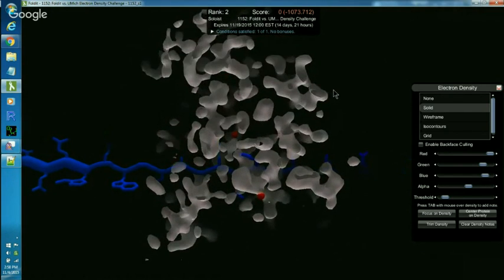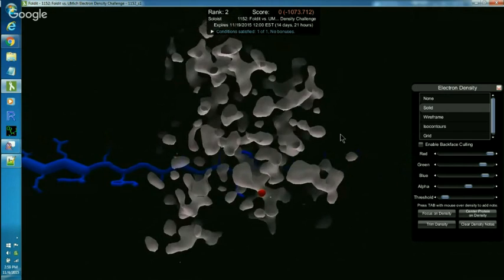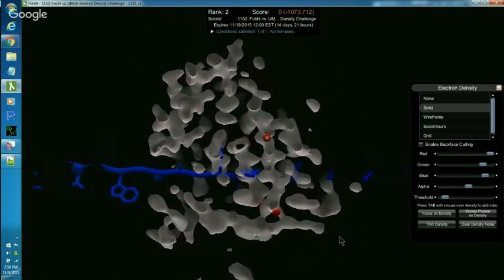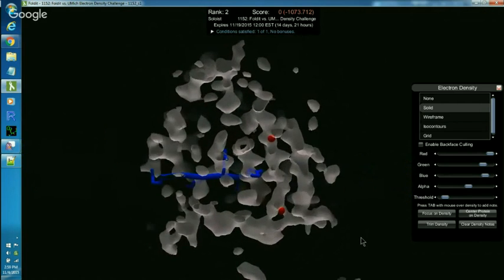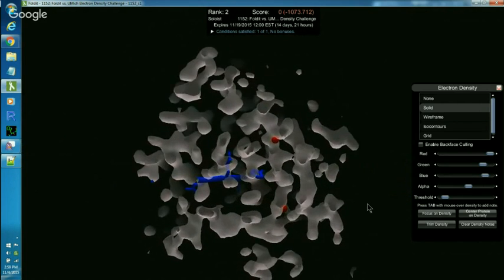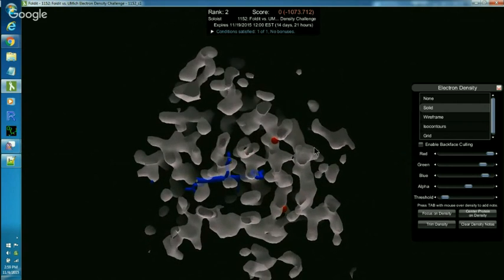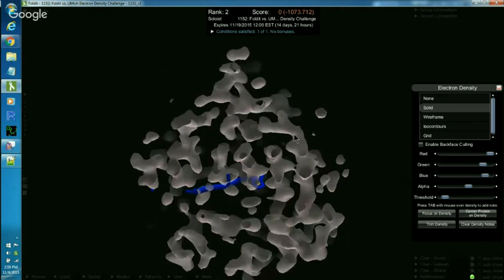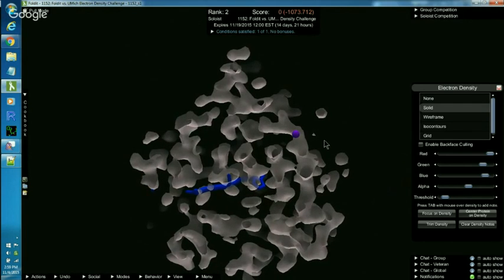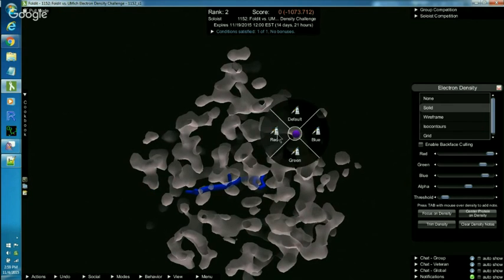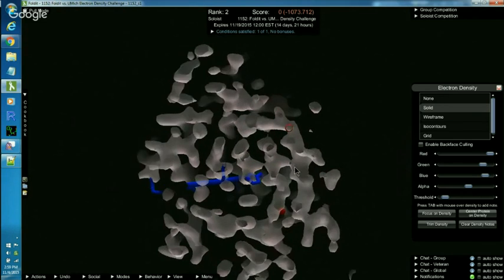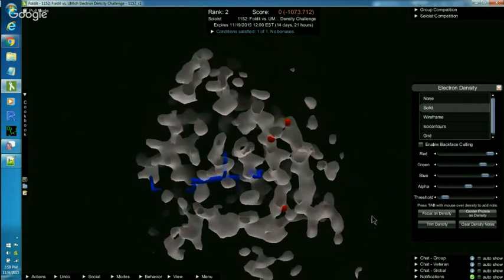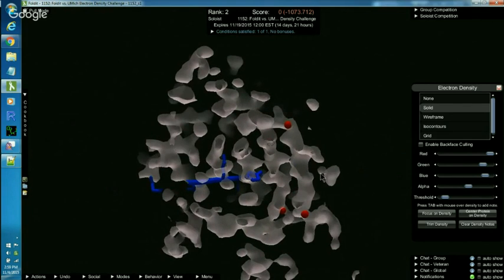Now, I see another sheet to the right here. A short one on the right. Where does that one start? Right up here. I'm going to put a dot. Again, my dot is not entirely visible because it's in the foreground. So, I just roll it back a little bit so I can see it. Where does that sheet end? Right about here it curls away.